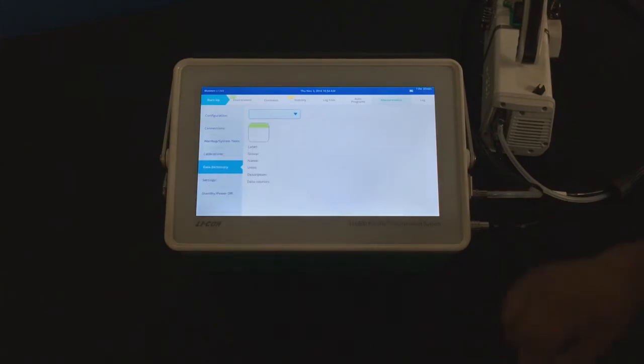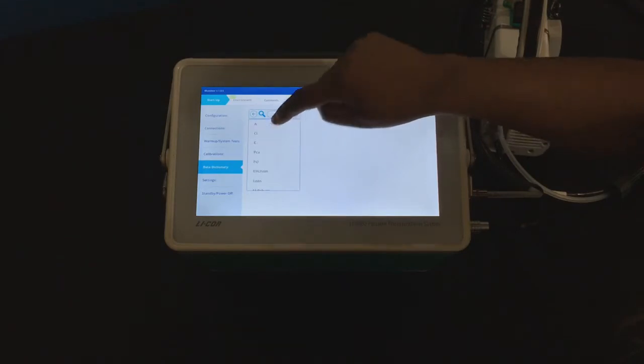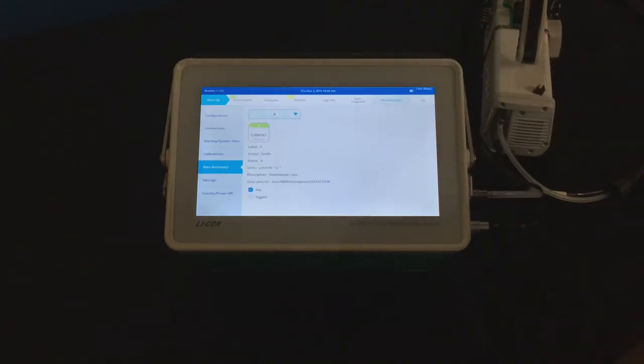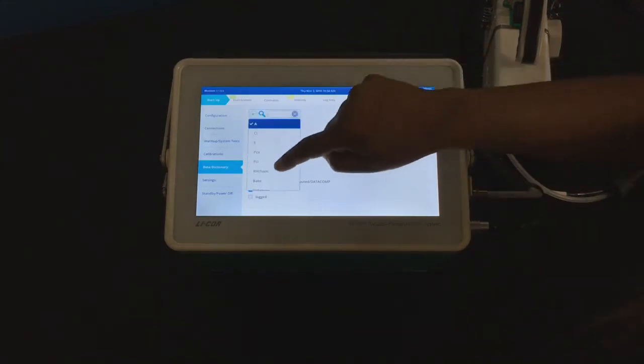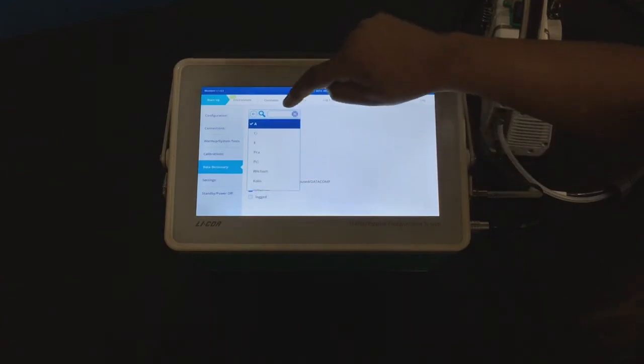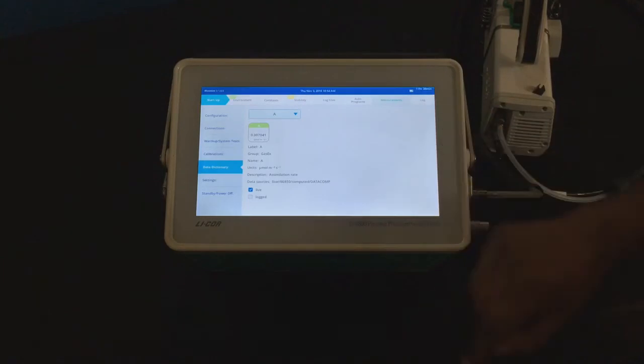below that is the data dictionary. The data dictionary can be very useful because it allows you to see what the various variables on the instrument are. For example, here we have A, or photosynthesis, or assimilation rate. And from here, you can continue to explore what we have on the instrument to see what their name is, the label, and where they're coming from.